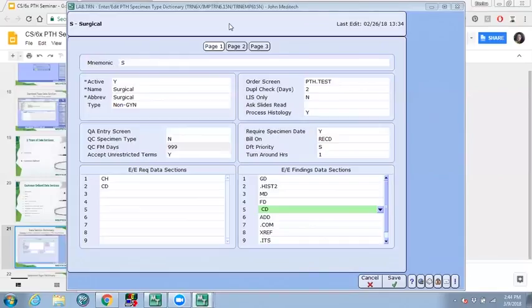They will also let us know, since we are presenting the pathology module today, and we can open tasks and assist them further with your questions. So Alicia, I'm sorry for not pronouncing correctly. Ashley McKenna is saying, if no defaults are set up on page 3 of the specimen type dictionary for MISQ sign, are they defined in the customer defined parameters?